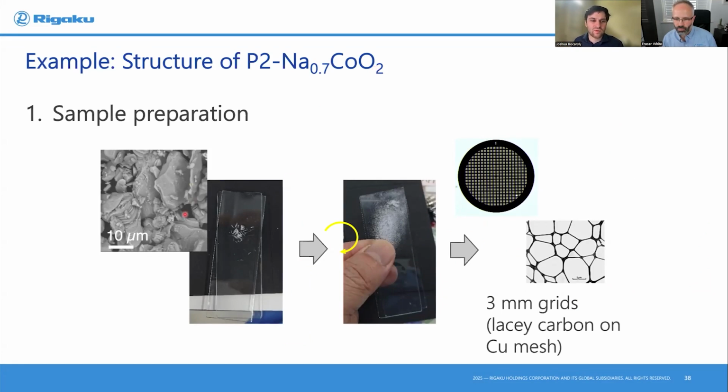For sample prep, we have one of these powders with varying size crystallites. We grind it up very well in a mortar and pestle first. And then we use 2 glass slides to grind a small amount even finer. This is an example. Our powders are not white. This is with a different powder. Ours would be dark, almost black.